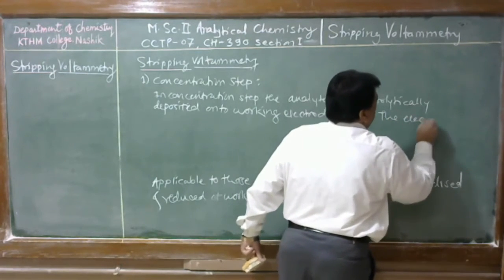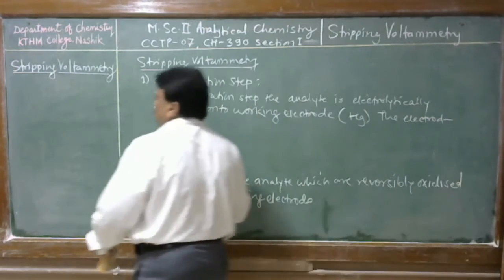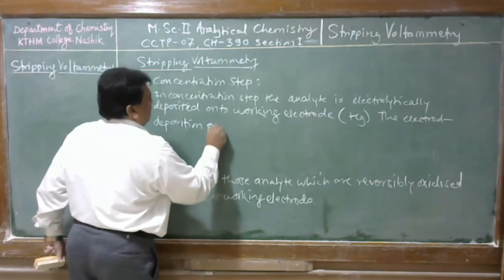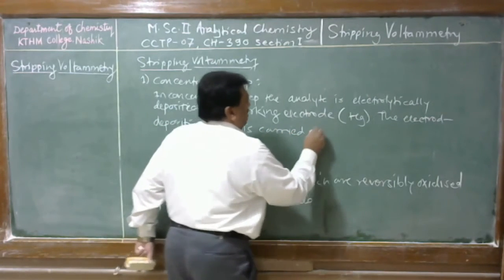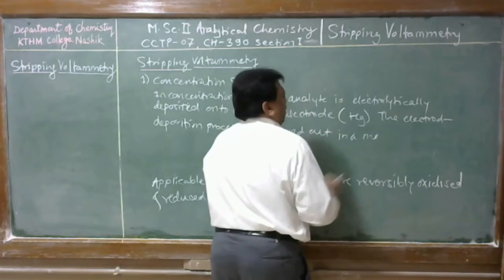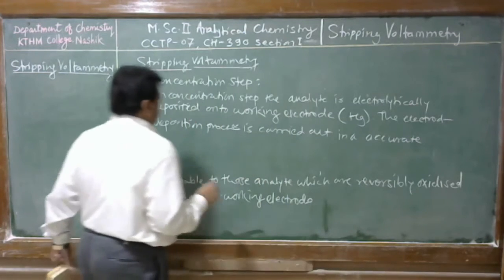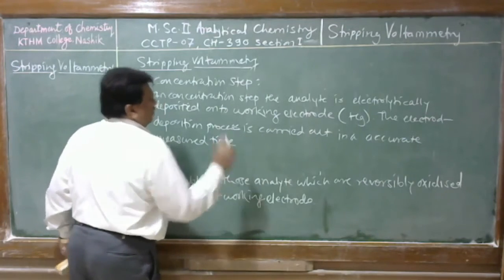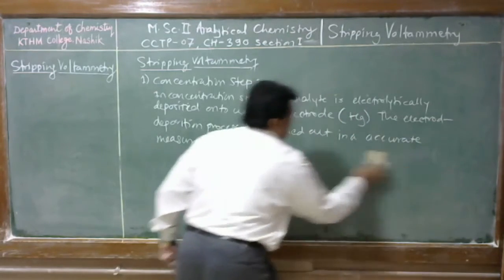The electrode deposition process is carried out in an accurately measured time. This time should be constant for sample as well as standard.